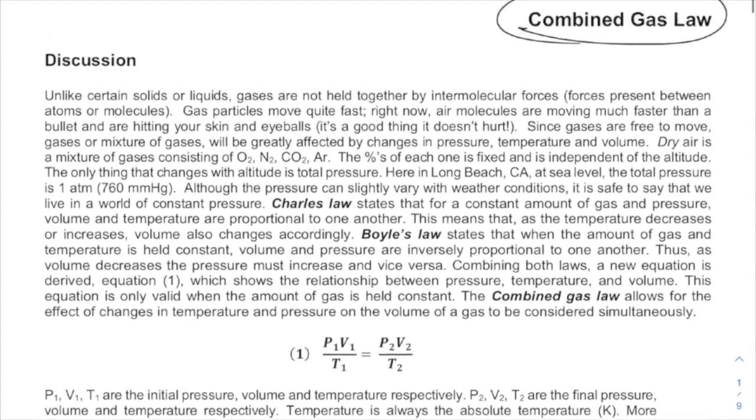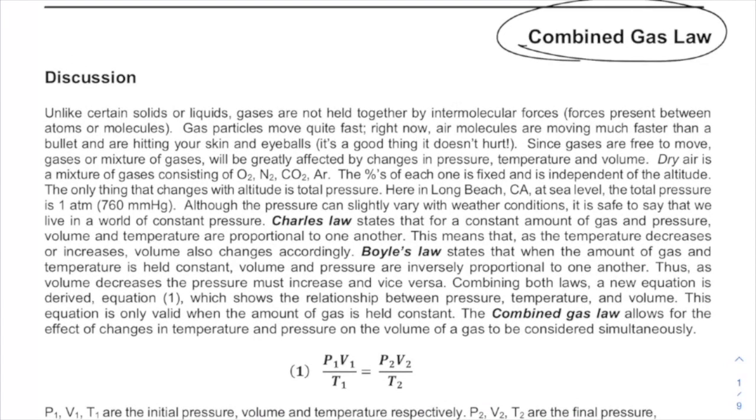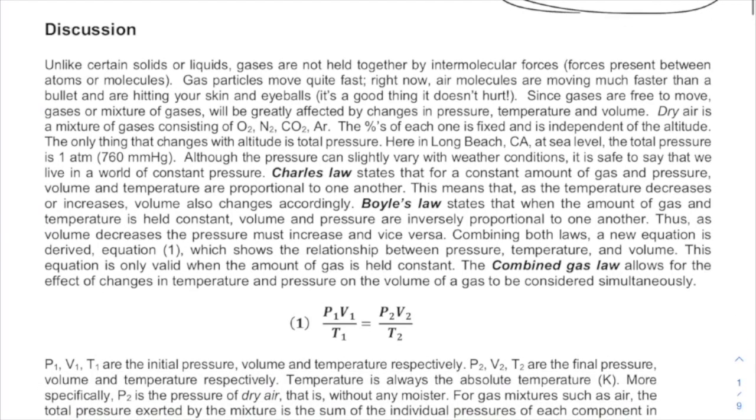So the whole purpose of this experiment is to measure the change in volume for a sample of air. How is the volume of air affected when you alter the pressure, when you alter the temperature? Okay, so I'll discuss this more in a bit.